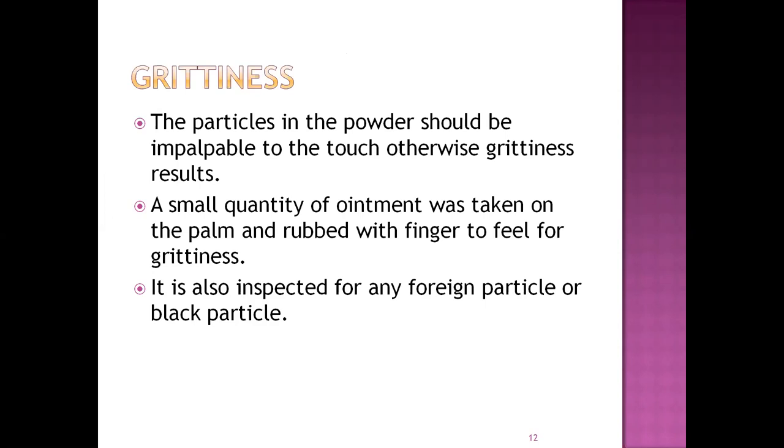Another one is the grittiness. In this case, the particles in the ointment powder should be impalpable to the touch, otherwise grittiness results. A small quantity of the ointment should be taken on the palm and rubbed with the finger to feel for grittiness. It is also inspected for any foreign particles or black particles. This is how we do the grittiness test for ointments.